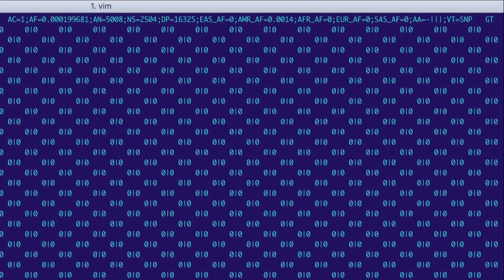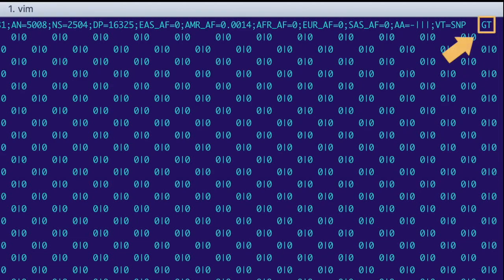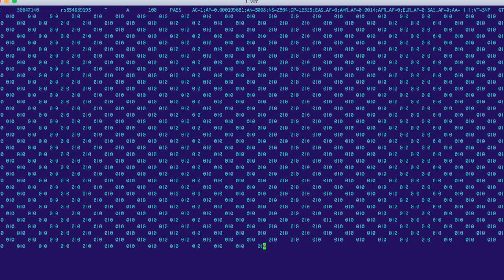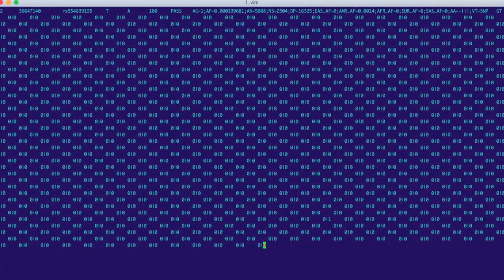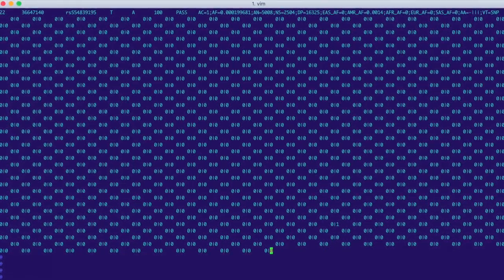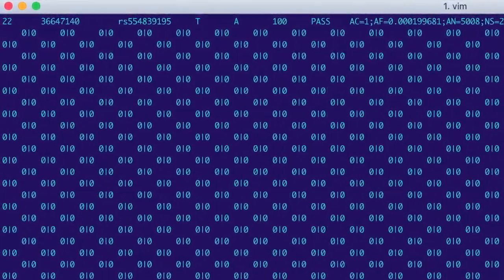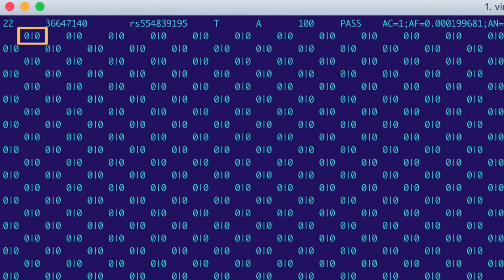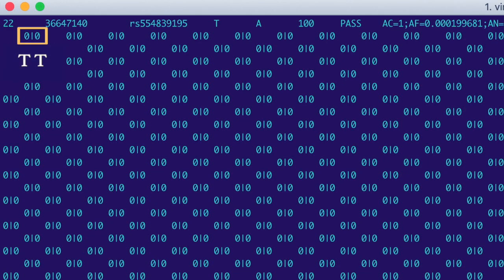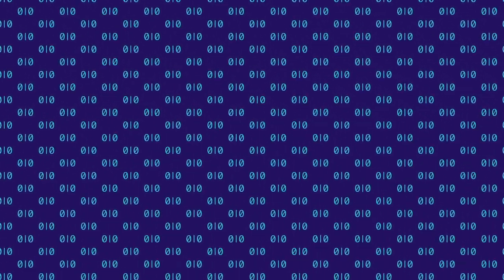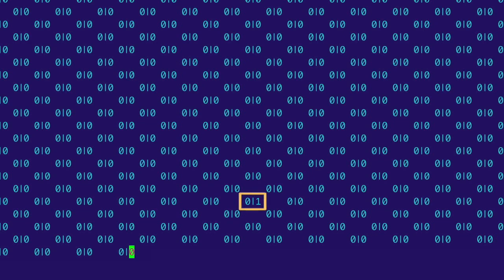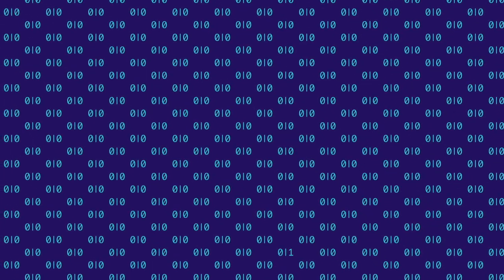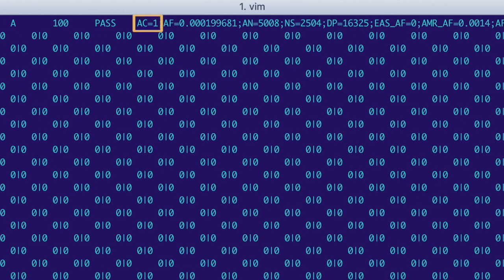Next, there is a GT in the format column, which tells us that there is only genotype information in the sample columns that follow. And finally, we have the genotypes of each of our samples. Our first sample is 0/0, meaning that it's homozygous for the reference allele, so its genotype is TT. But this sample way down here is 0/1, meaning it has one copy of the alternate allele A, so its genotype is AT. This single alternate allele across all the samples explains why the allele count in the info column is 1.